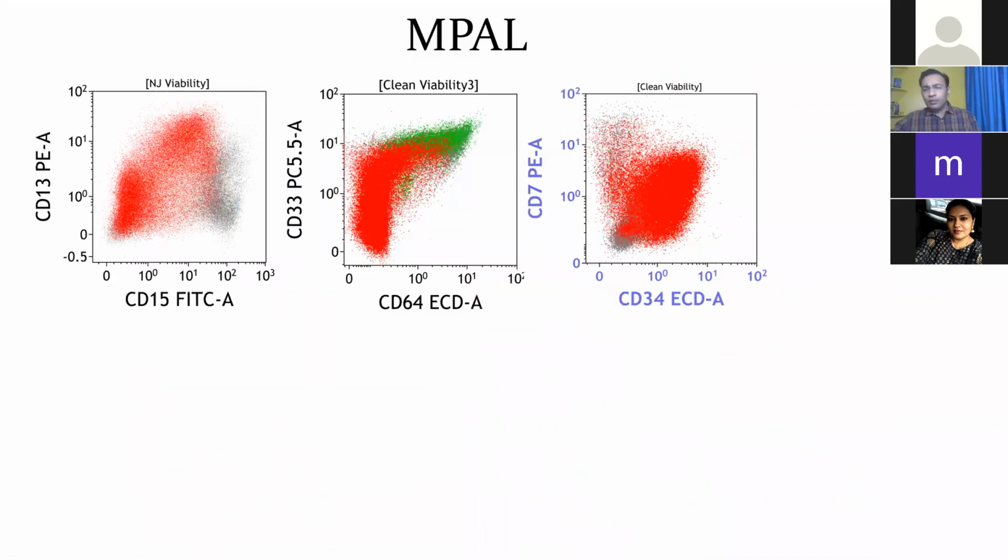So I think I'm completing one hour, so I'm moving a little fast to mixed phenotypic acute leukemia, and I'll be touching a couple of other assays, which also will be covered. Generally, we use flow cytometry.